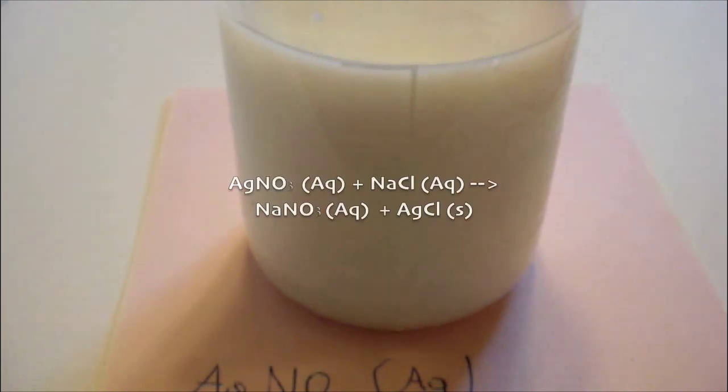When you are adding the sodium chloride solution, you will see white clouds appear. This is the silver chloride. This is the reaction: silver nitrate plus sodium chloride gives sodium nitrate and silver chloride.